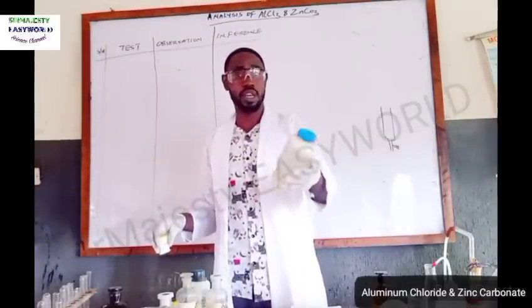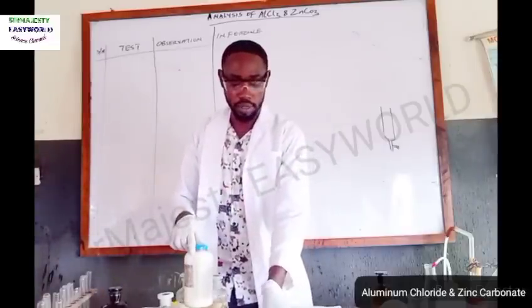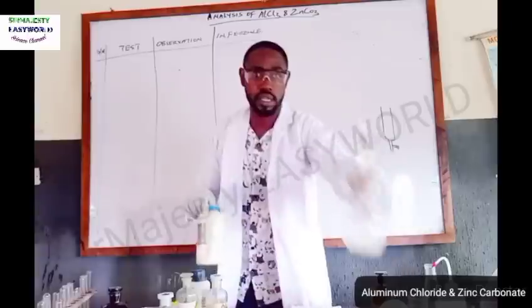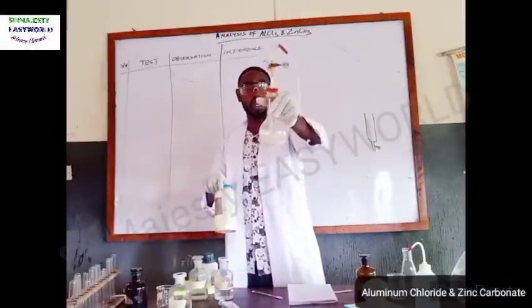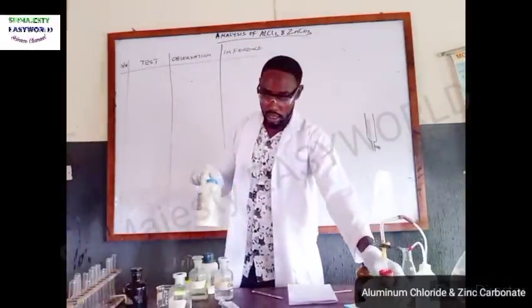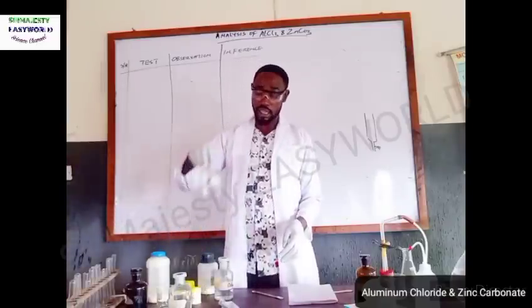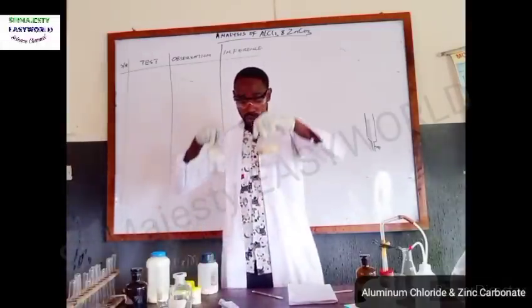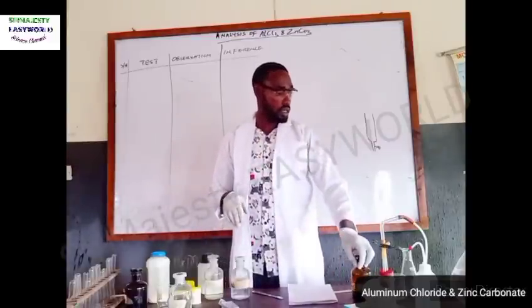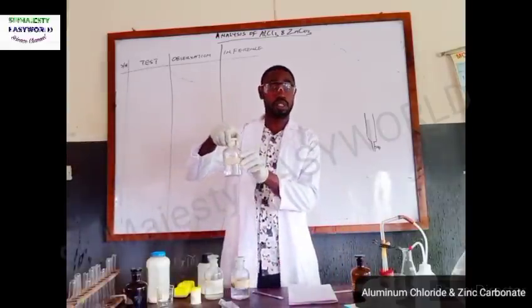Zinc carbonate, actually on analysis I discovered it's not pure zinc carbonate, so I have to produce another zinc carbonate here. And it's also inside this vessel which I will use to bubble the CO2 into lime water so that you see how it turns it maybe. Therefore, then we also need the reagents such as aqueous ammonia, aqueous sodium hydroxide, and we need dilute HCl. Then we also need lime water, which is here.